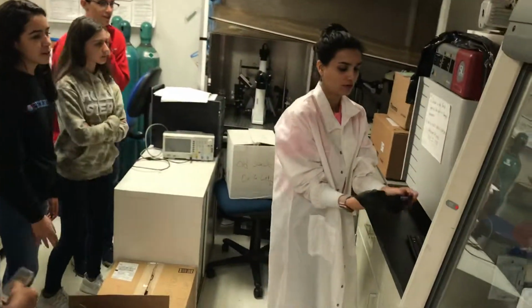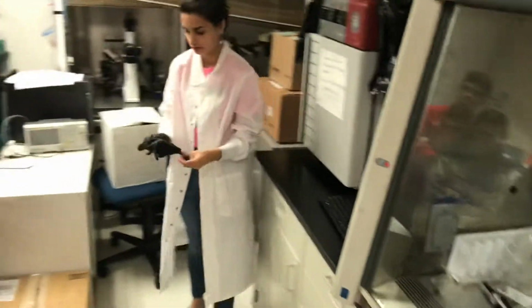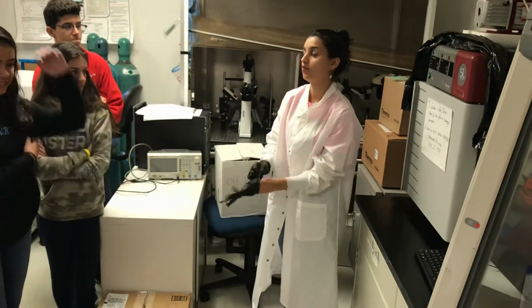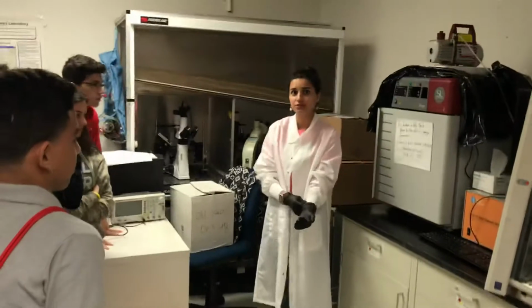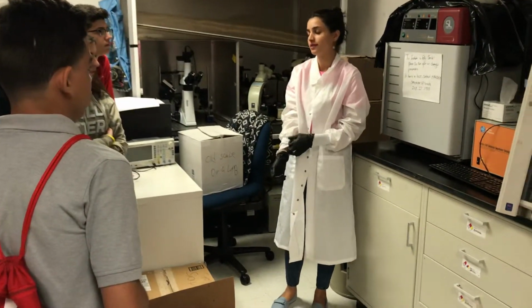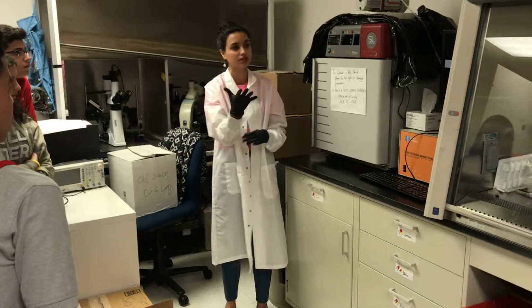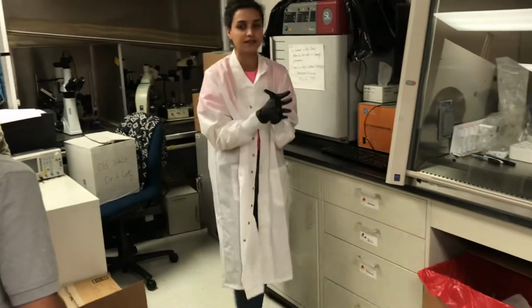Now I have one recording right now. You saw, excellent, that's an incubator. What is an incubator for? Why do we need an incubator for cells? Excellent, because your body is 37 degrees. We can't just leave them outside in this weather because they're gonna be frozen and die, okay? So this is 37 degrees and 5% CO2, which is the best environment for them to grow.